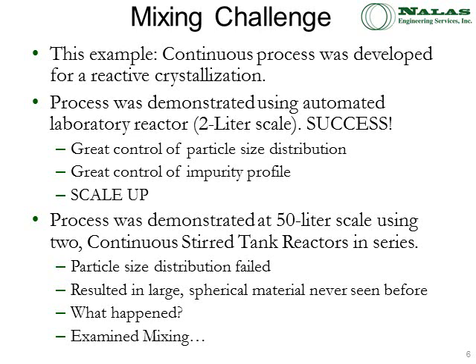So what we thought would be great is to give you a specific example. In this example, we were developing a continuous process. It was for a reactive crystallization where particles were actually forming as we were dosing in and generating the product. This process was demonstrated using an automated laboratory reactor at the 2-liter scale, and we had success.